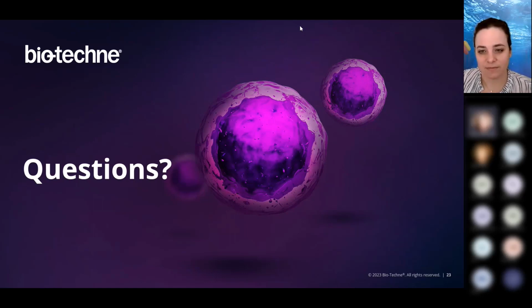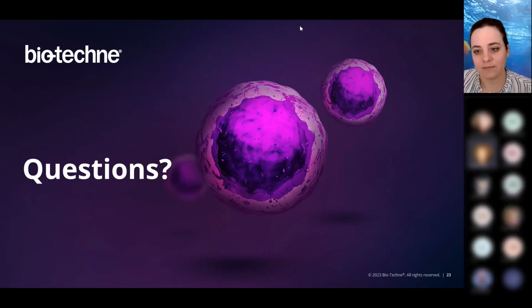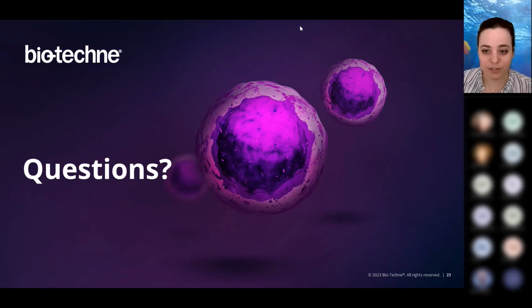Awesome, thank you. So Monica, the question that often comes up is that if people have 3 sample sets and they have to do 3 separate runs, can these sample sets be normalized as one set? Yes, you can normalize them as one set. I would recommend putting in some sort of internal reference control or something like that to account for any plate to plate or instrument to instrument variations, and then normalizing from there. Sounds good. Thank you.